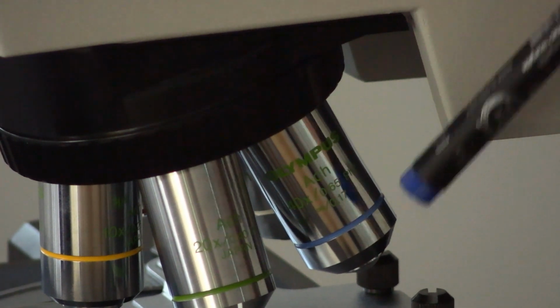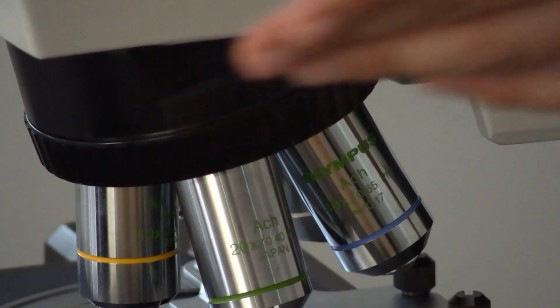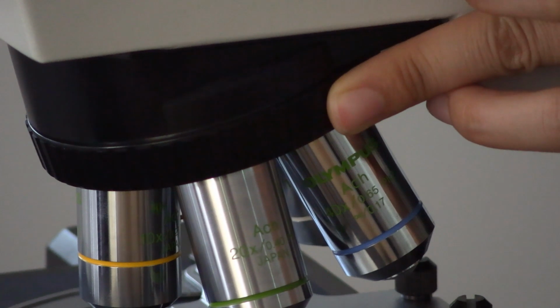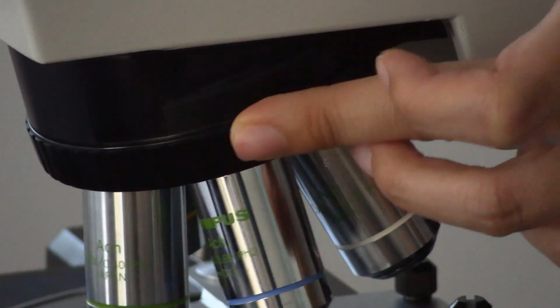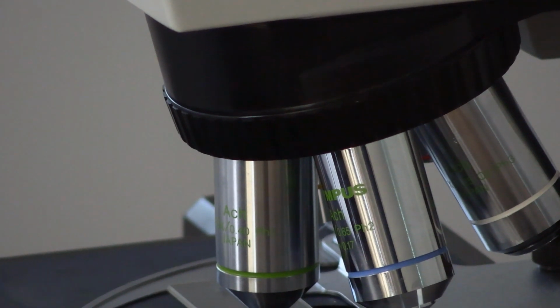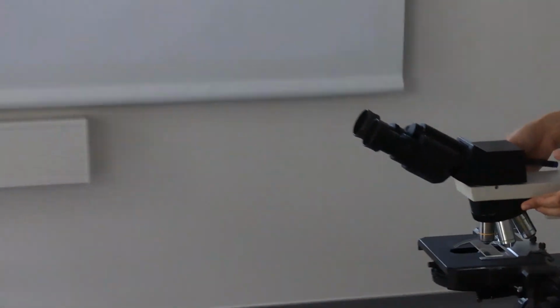And what else? When you want to change objectives, you can just turn this, and it will change the objectives.